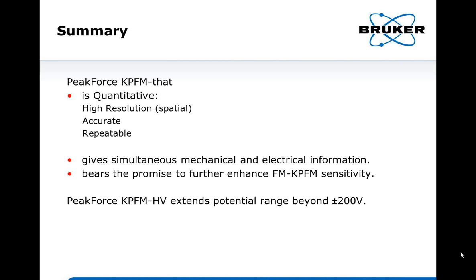That is true for all samples that have oxide on them. It modifies it, but if you look at a series of metals with oxide, they still follow the trend that their work function suggests.